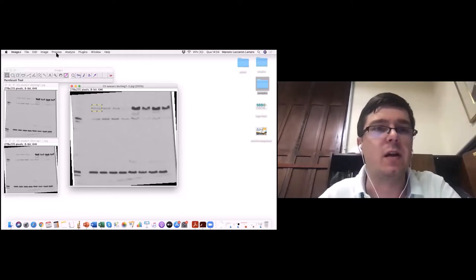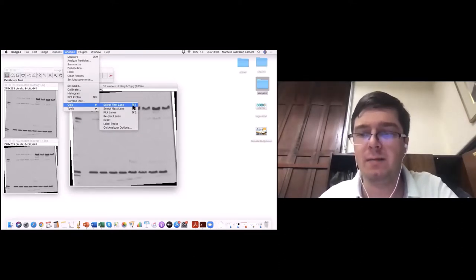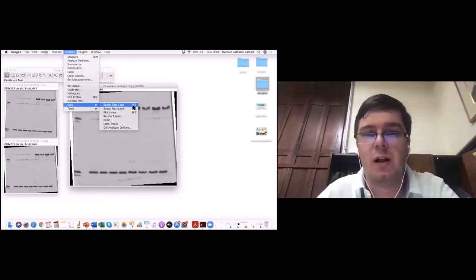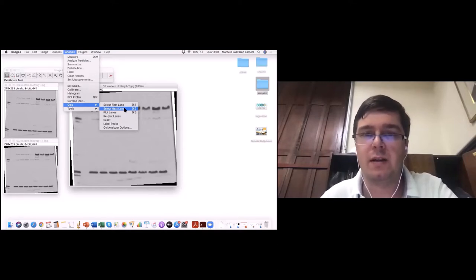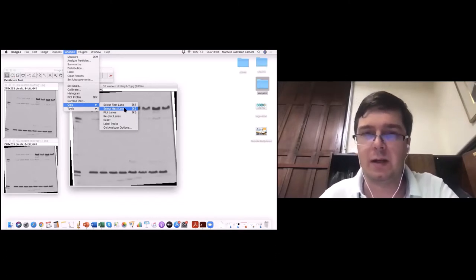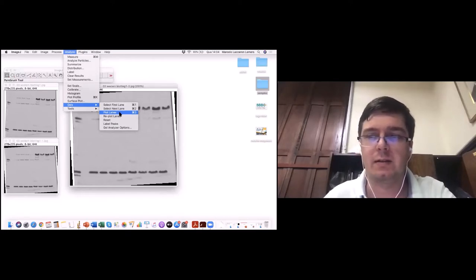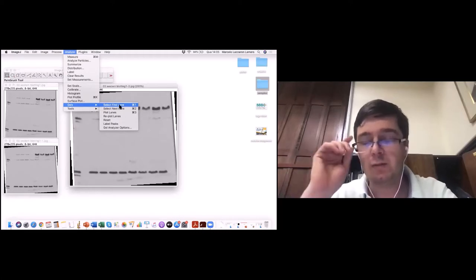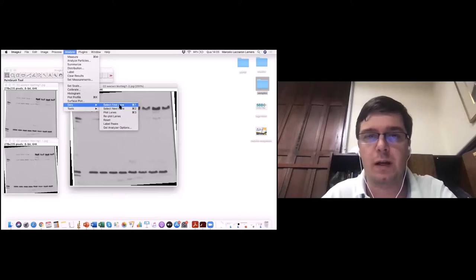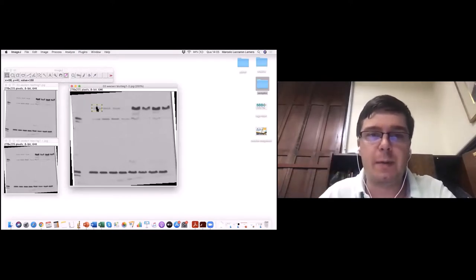Há duas maneiras de fazer isso. Podemos usar a ferramenta Analyze Gels, selecionar a primeira linha para começar — para a primeira banda, sempre é essa função. A segunda banda em diante usa o comando 'selecionar a próxima linha'. Na última banda, usa-se o comando 'plot lanes' para finalizar a densitometria. Um jeito mais fácil é usar o teclado: apertar a tecla 1 para a primeira banda. Quando clicado, apareceu o número 1 na imagem.